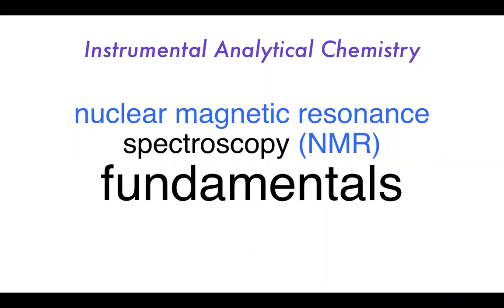Whether they're hydrogen atoms attached to a carbon, whether they're hydrogen atoms attached to a nitrogen, whether they're hydrogen atoms attached to even a silicon atom, that kind of thing. And so you're able to assign them with much more reliability. It's much easier. You can just look up a table of data and very reliably you will find the peak positions of reference.